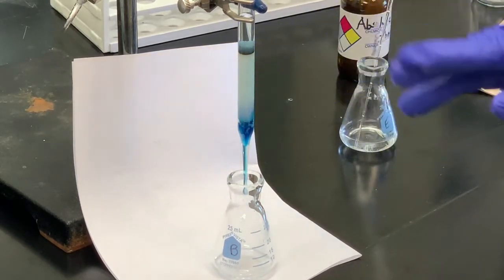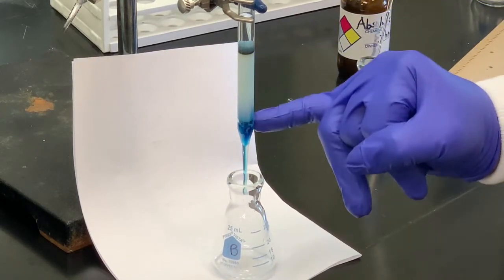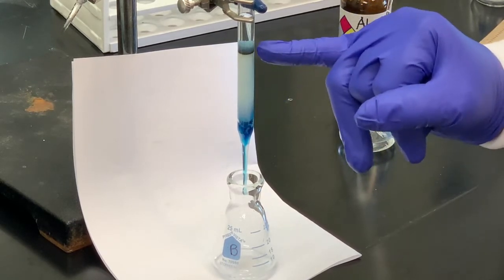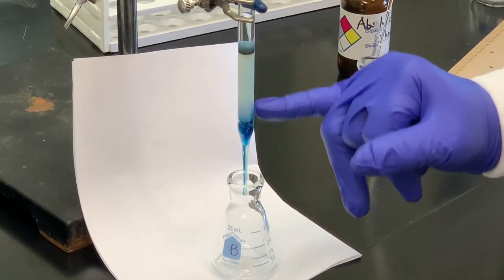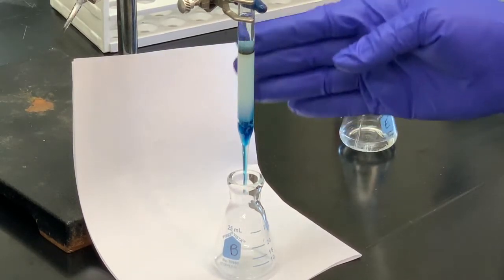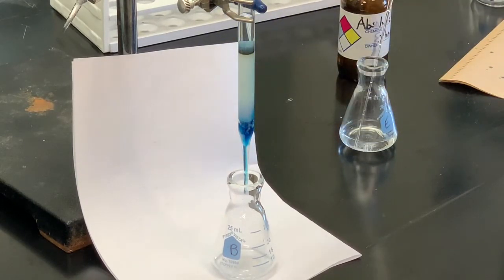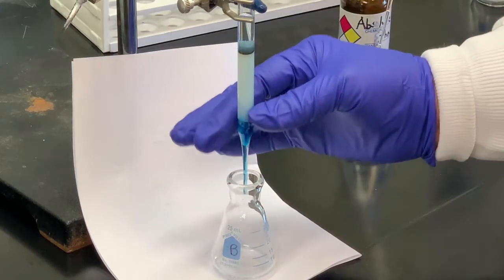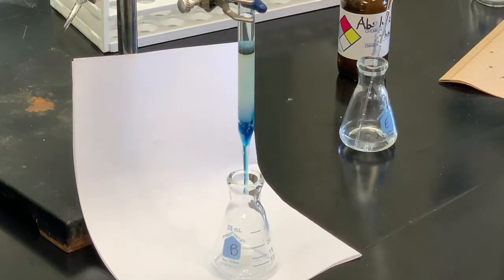It is possible when you're doing a column chromatography experiment that you may see bubbles or holes or gaps. We call that channeling, and it's not uncommon for that to happen. A lot of that has to do with how well you pack the material. If you didn't tap the alumina or silica gel as it was being added, or didn't pack it correctly, you can have gaps in there and those gaps will show through during the experiment.